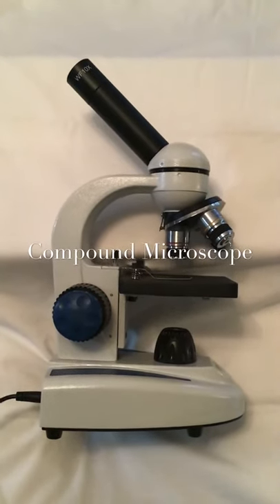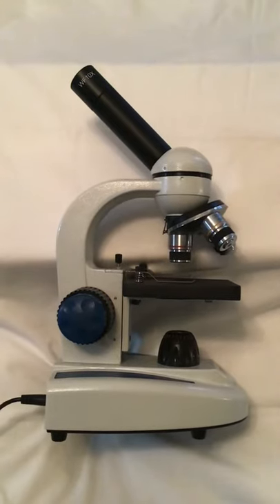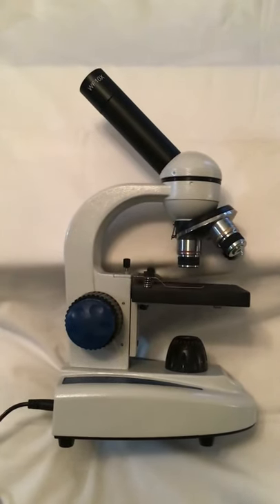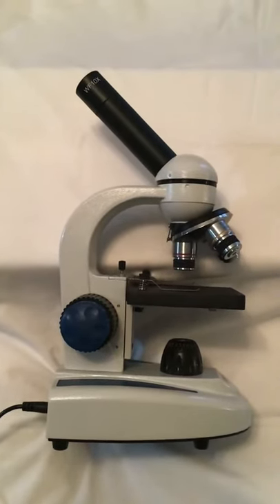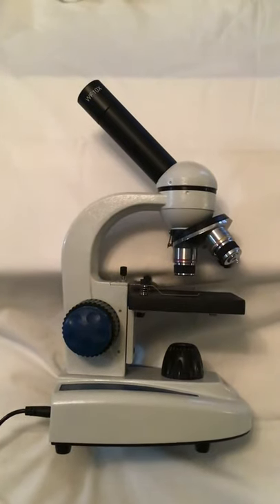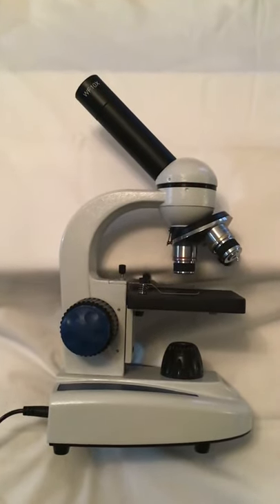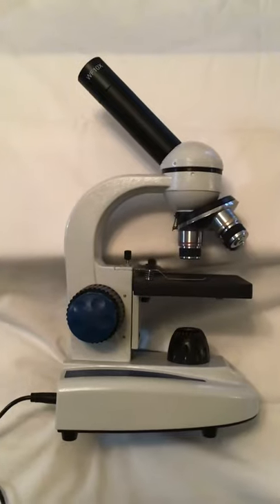Hello class, today we're going to be talking about a compound microscope. We're going to look at the different parts that make up the microscope as well as what their functions are.